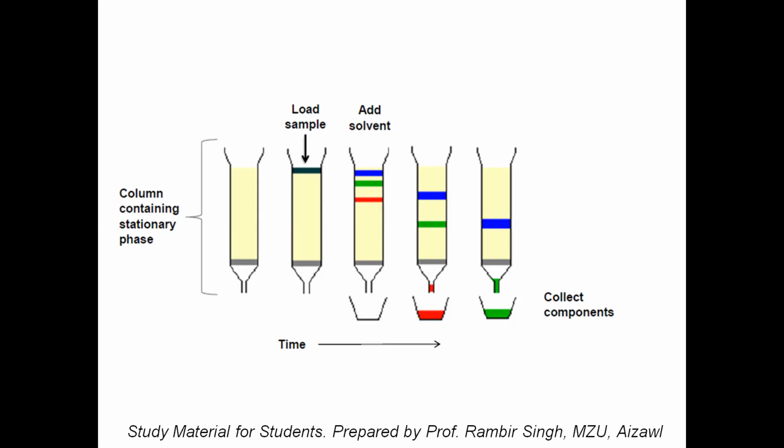The mobile phase interacts much more efficiently with the solid phase. So then what will happen? The components do not get adsorbed that efficiently. Then what will happen? And then they tend to elute out at a similar rate, I think. Very good.